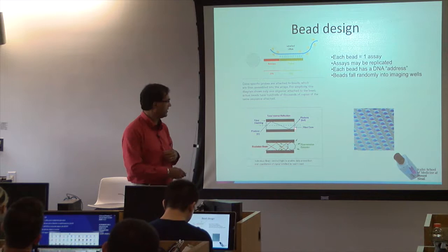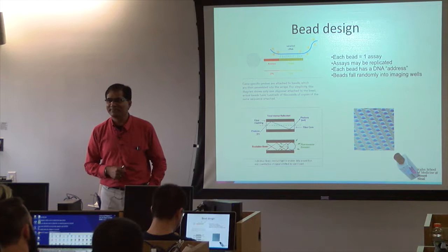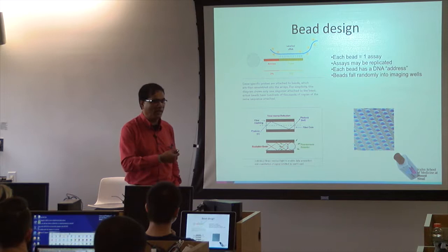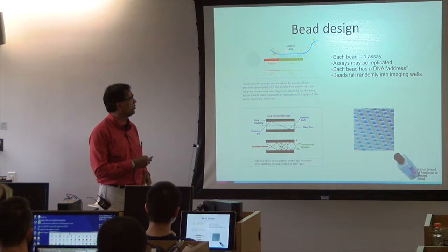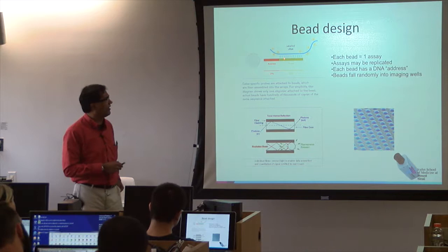Okay? And then we can take the DNA. It could be a cRNA here. Suppose we are doing expression profiling, we take a cRNA. How do you make that cRNA? If you take the RNA, hybridizing that RNA becomes a problem because you need to have the copy. Instead of cDNA, you'd make a cRNA. Generally, you take the RNA, convert that into cDNA, and then put a T3 or T7 promoter on that, and do another transcription, so you get the cRNA. Right? So convert that into cRNA, and then label that cRNA with any fluorescence label you want.